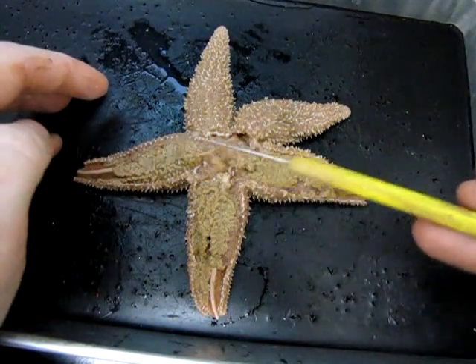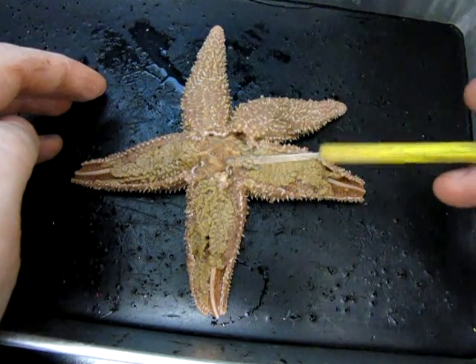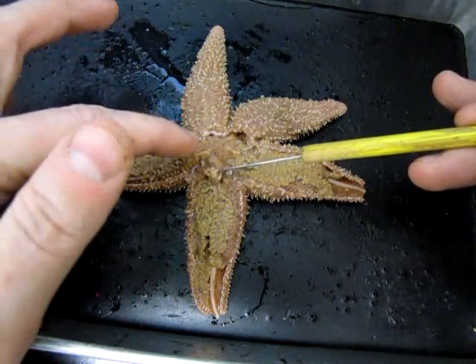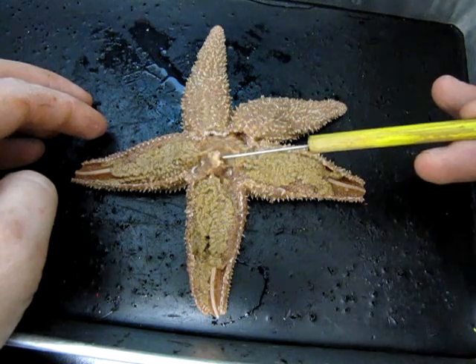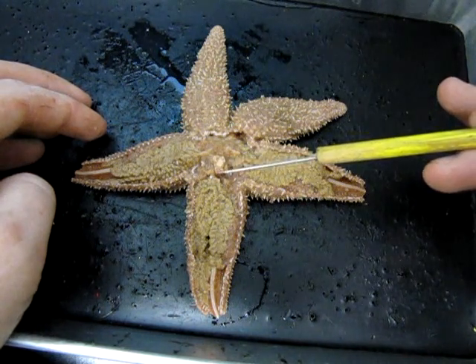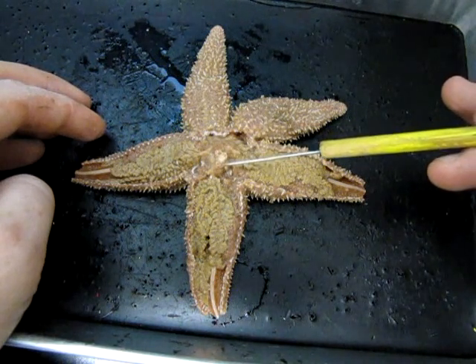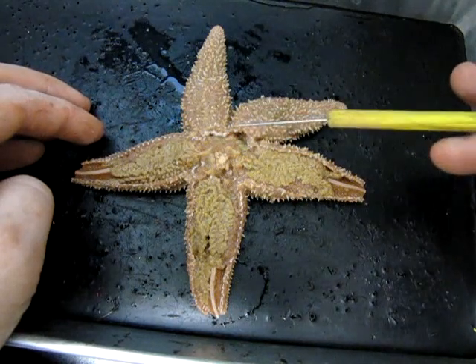I've removed the body wall from the three arms and also from the central disc. As I was cutting the surface of the central disc off, I was careful to leave behind the madriporite that I showed you earlier — the little round white structure. If possible, try not to remove that part of the skin; simply cut around it.